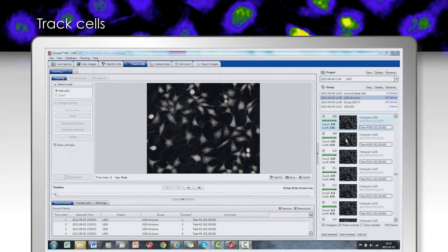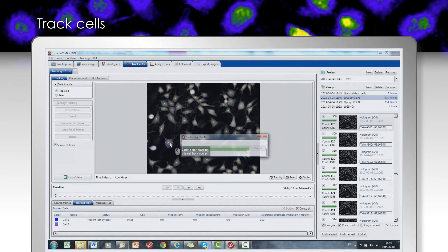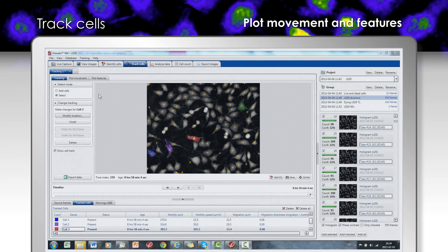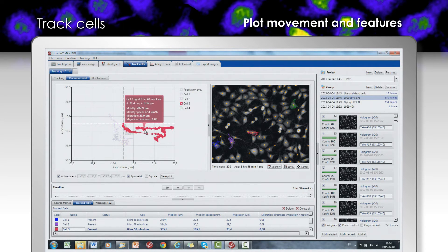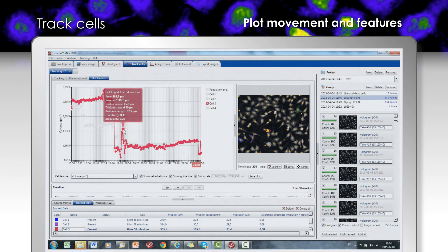The segmented cells can be individually selected to simultaneously track cell movement and changes in cell morphology over time. Individual cell movements are displayed in spatial plots with related quantitative parameters, such as cell motility speed and cell migration velocity. Tracking of related measured morphological parameters is done automatically. Here, we are following changes in optical cell volume over time.